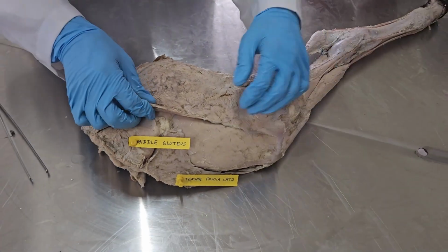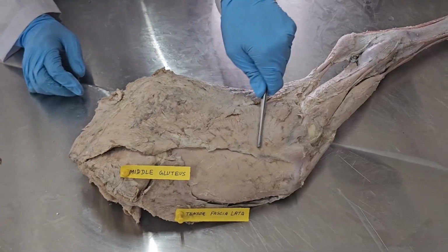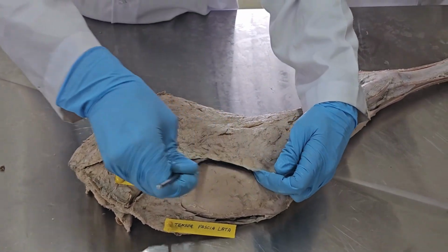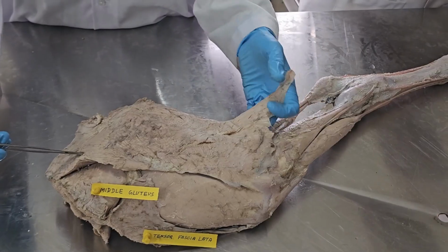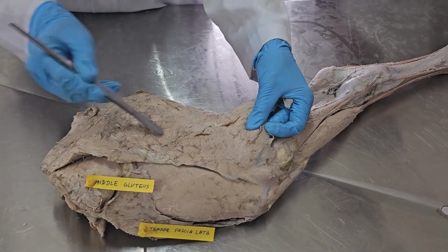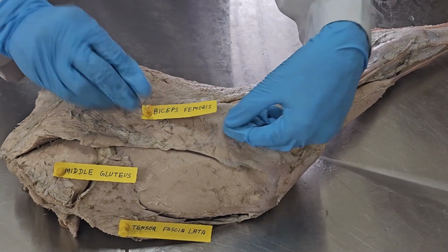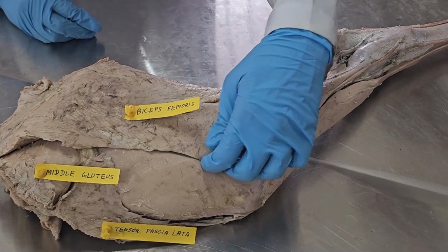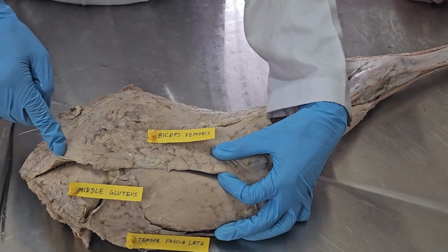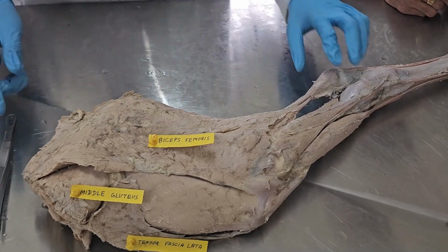Now after that, you can see a very big muscle. This entire whole muscle, this large muscle, is the biceps femoris muscle or gluteo-bicep muscle. This big muscle is the biceps femoris, or gluteo-bicep muscle.